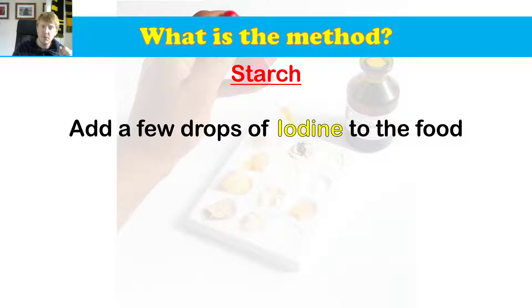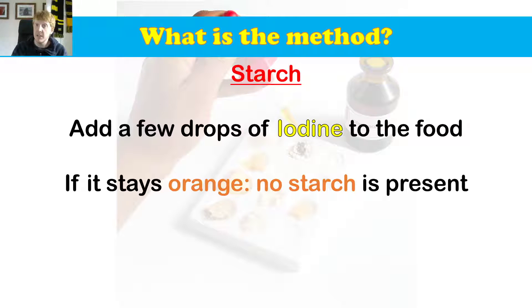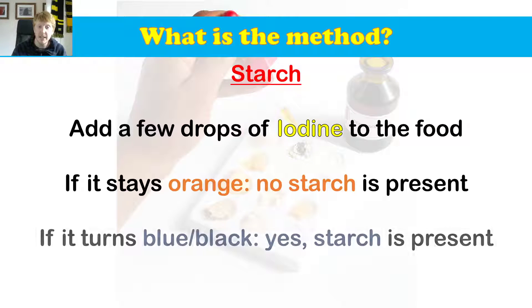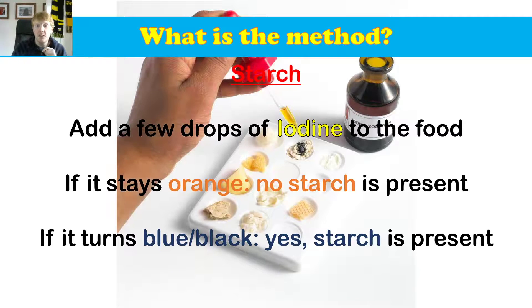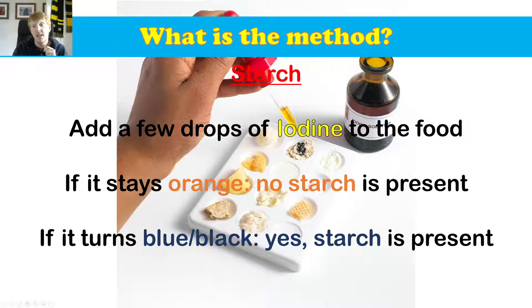What about starch? We've done this if you've watched the Enzymes RPA. You add a few drops of iodine to the food. If it stays orange, no starch is present — that's just the color of the iodine. If it turns a blue-black color, then starch is present. You can see this black color under the iodine now, and that blue-black color means starch is present.